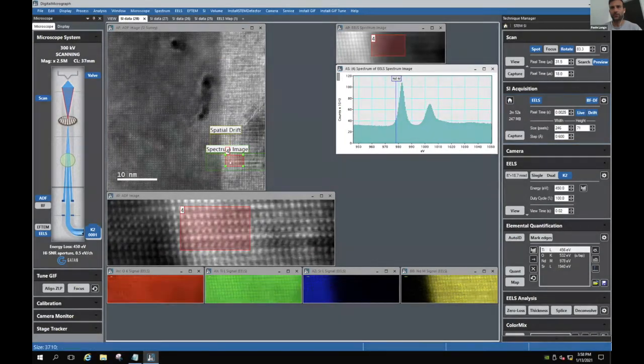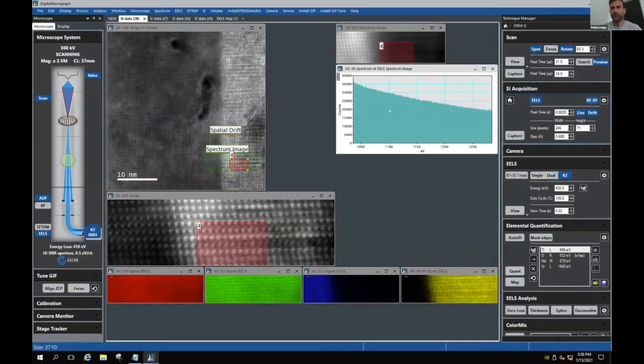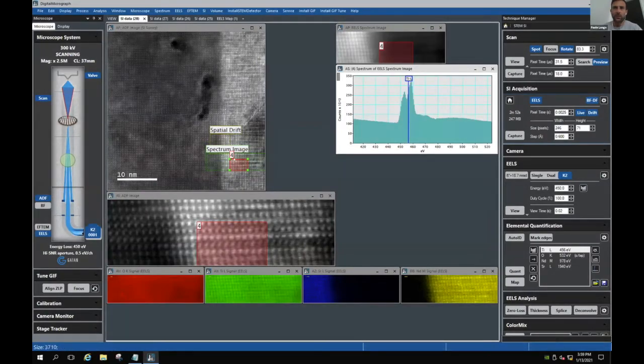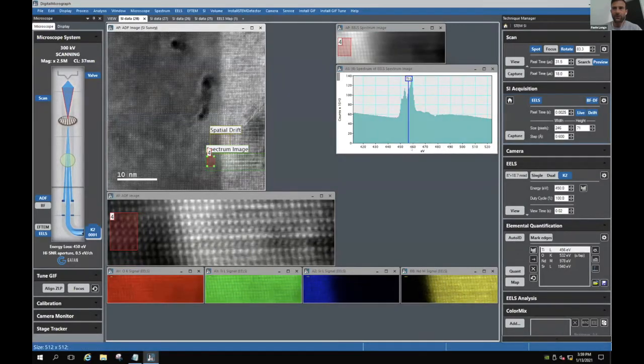Yeah, you see pretty good quality there. So the extended fine structure, as you asked, you actually look at the feature right outside, and you really need the good quality to see that. But you want to see some MLLS fitting, okay? All right. So if you want to do MLLS fitting, the new software we could do that nearly automatically once you set up your reference. So this is from.